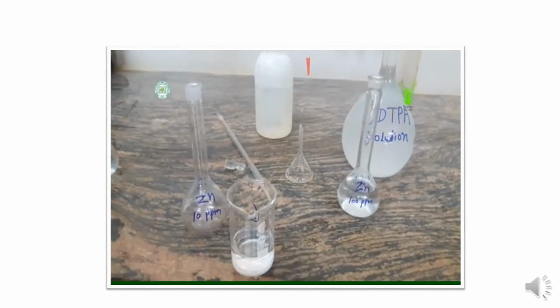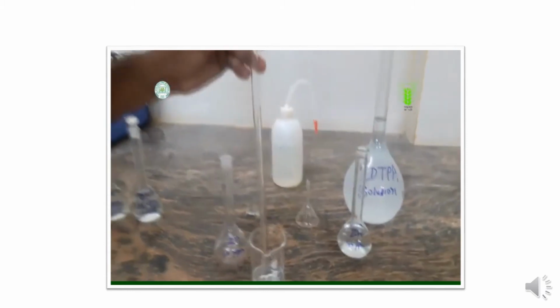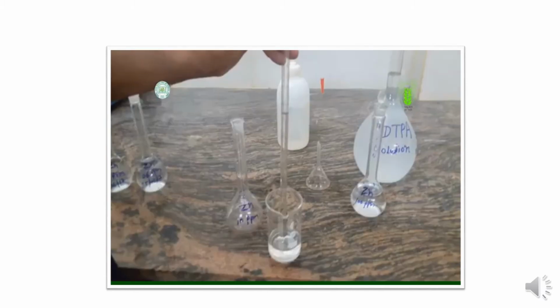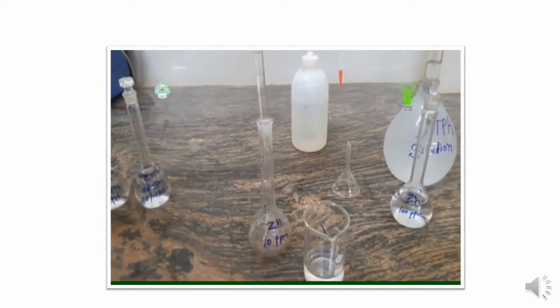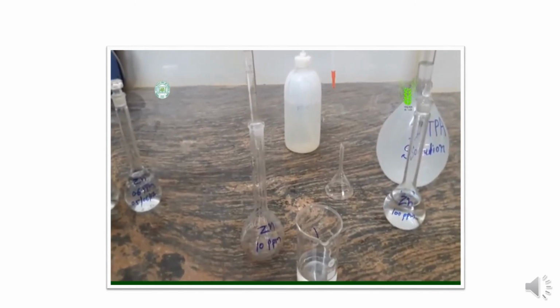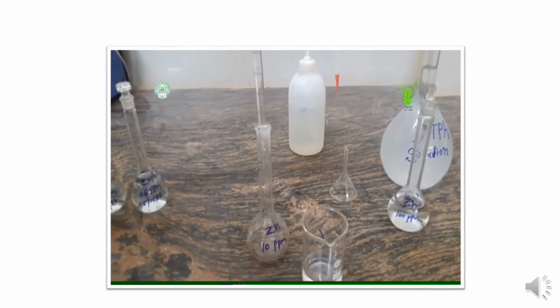First, we need to dilute the 100 ppm stock solution and pipette 10 ml diluted solution into a 100 ml flask, and then dilute to volume with DTPA solution. This solution will contain 10 ppm zinc.